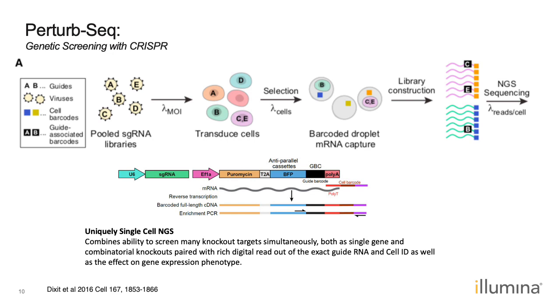But overall, I wanted to again stress the value here of this method, which is a means to analyze the transcriptional effect or phenotype in addition to the survivability of a particular knockout. It can actually potentially lead to a decrease in the cost and amount of time needed to further assay the complex effects of these perturbations in your screen.